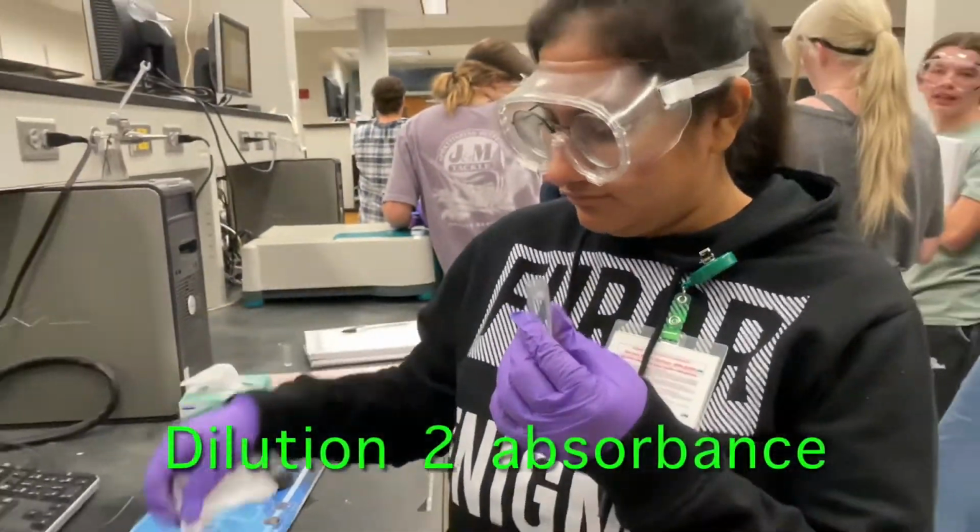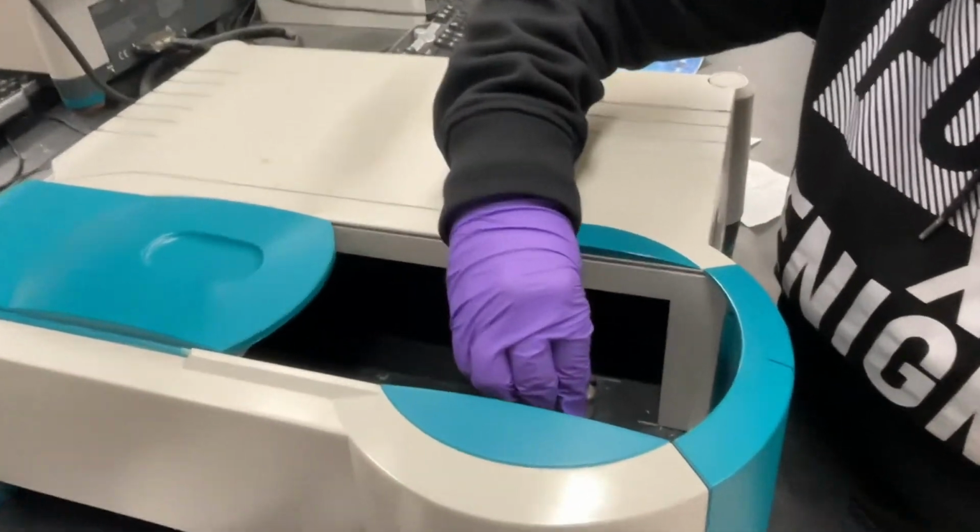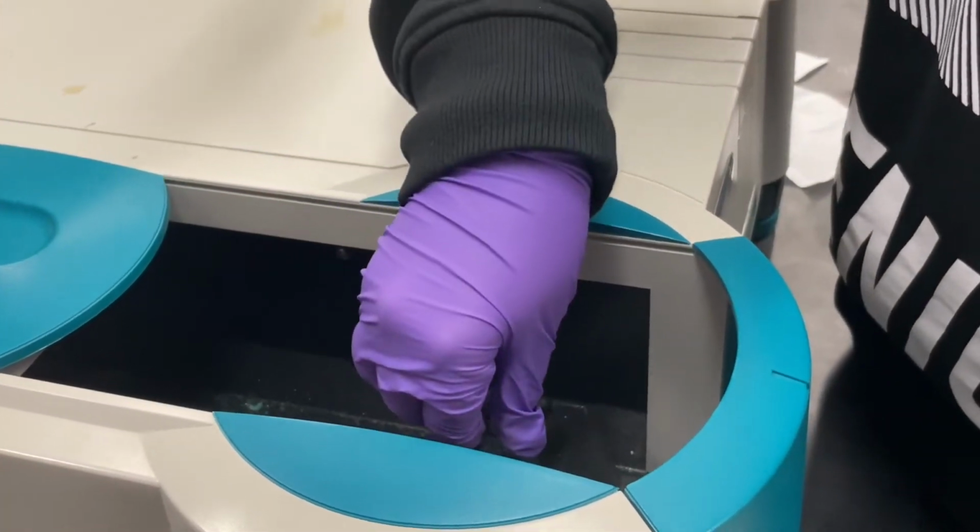Then, just the same as the first two, we decided to take the absorbance value of dilution 2.